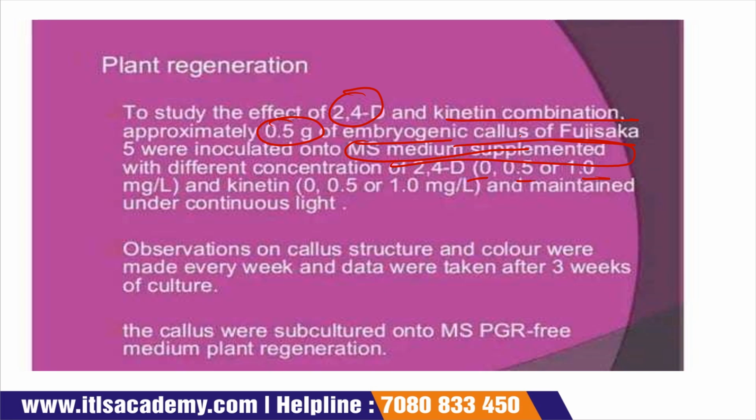Along with 2,4-D, we also use kinetin of different concentrations, 0.5 and 1.0 milligram per liter, and it is maintained under continuous light. Observation of callus structure and color was made every week, and data were taken after 3 weeks of culture. Then the callus was subcultured into MS plant growth regulator-free medium for plant regeneration.